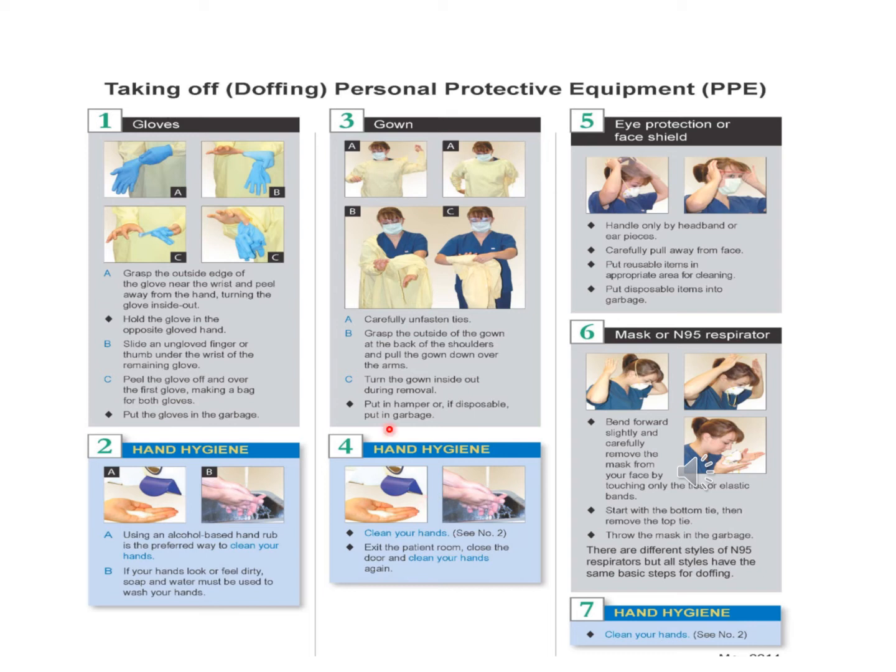Hand hygiene is very important at each step, because once you remove the gloves, you need to clean your hands, and now you are removing the gown, so definitely at this step you also need to clean your hands, to avoid any chance that your hands are contaminated, right?